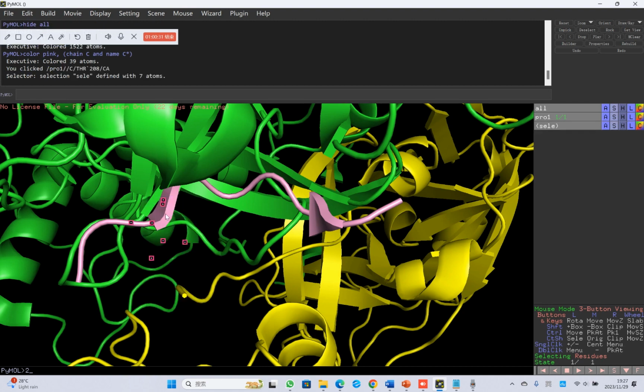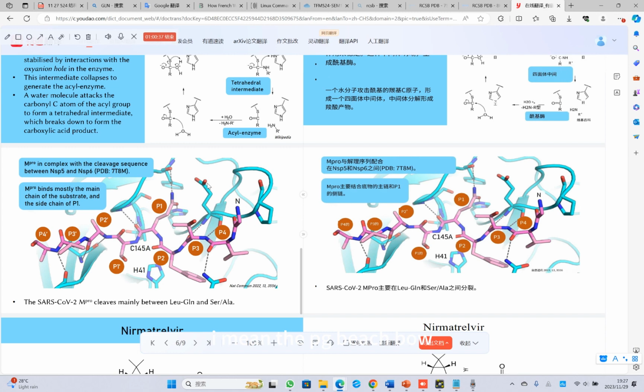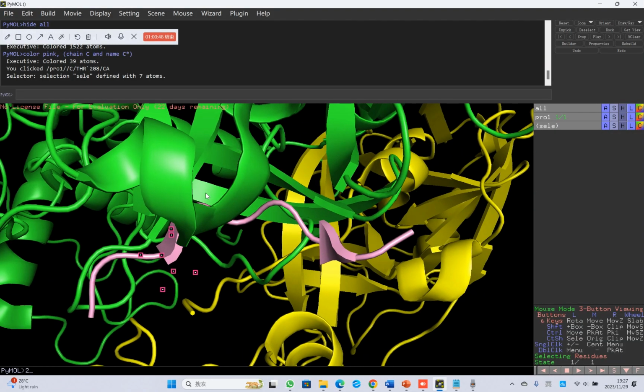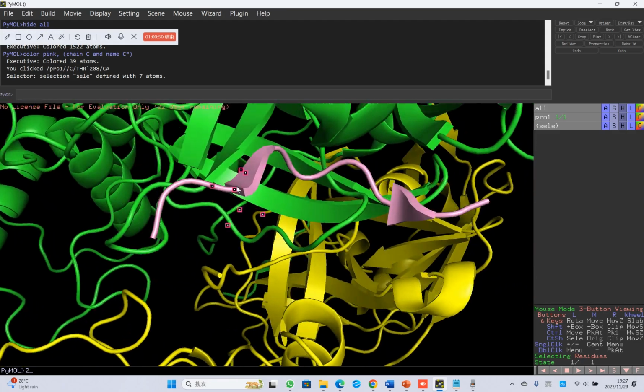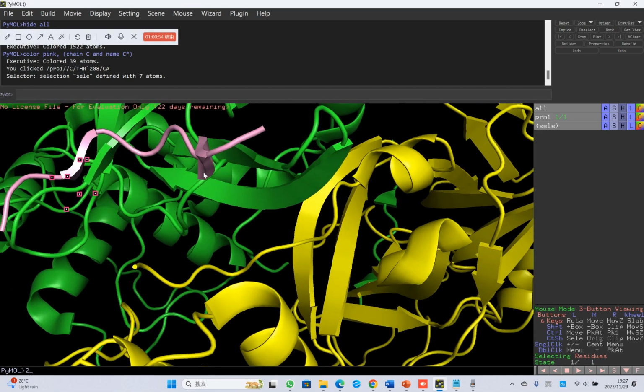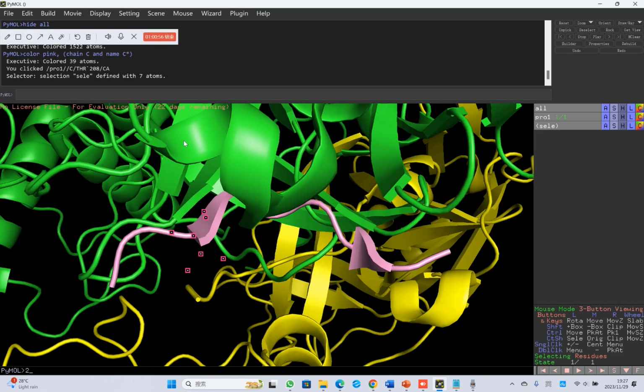No, I mean the PDB file. You have to put it inside the same folder as this document file. Can you show me? Where is the PDB? I'm really busy.